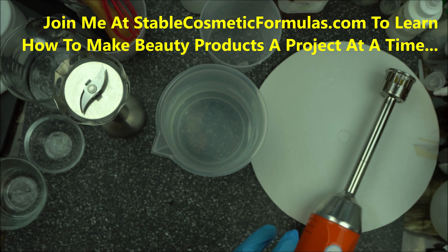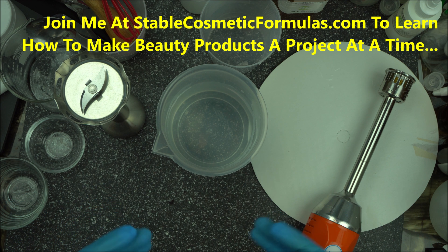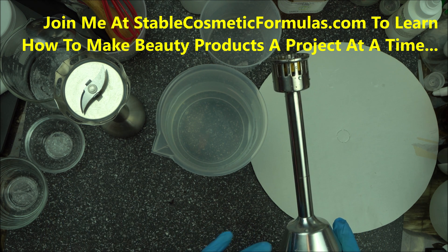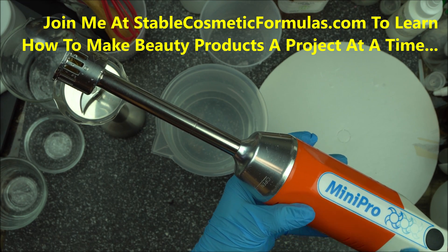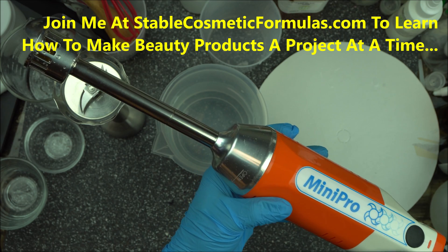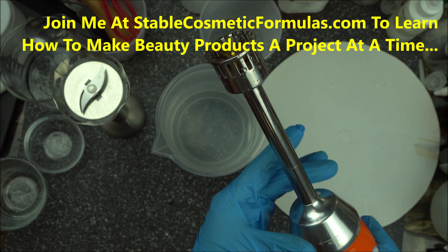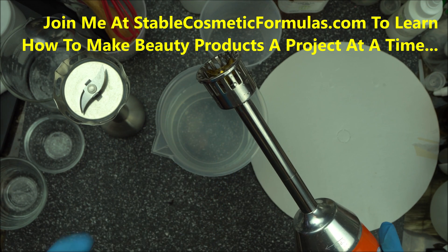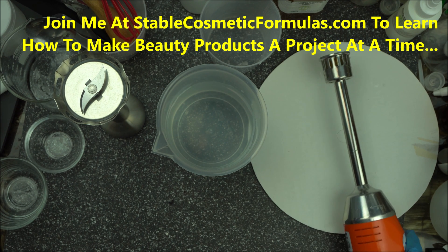I hope this video has been helpful. Remember, the best you can do is to always upgrade your tools as you increase your formulation knowledge and as you can afford it. Just know that the bottom part is the Mini Pro mixer by Dynamix, and the attachment is the homogenizer head — they are different tools. The homogenizer attachment is very useful for cosmetic formulators.